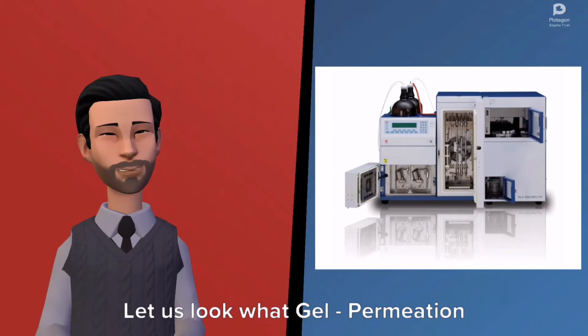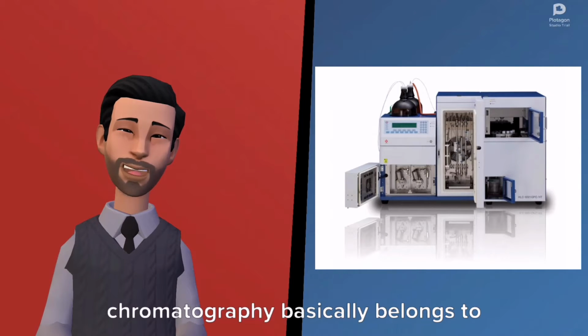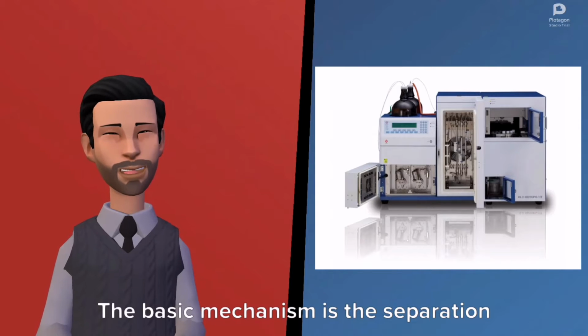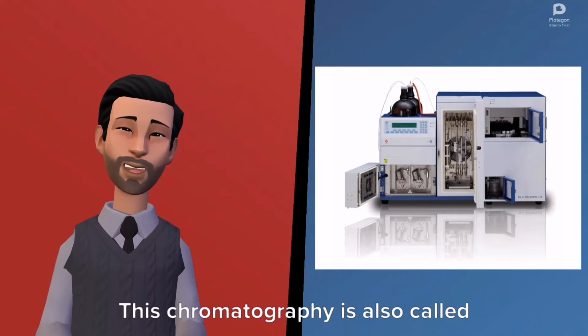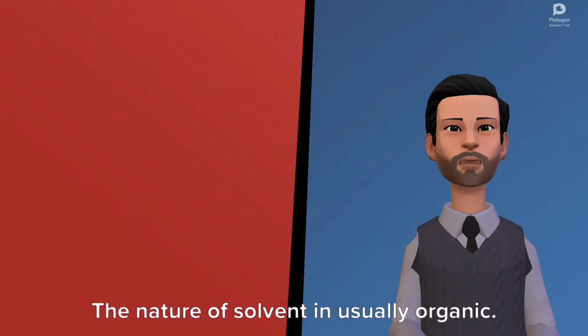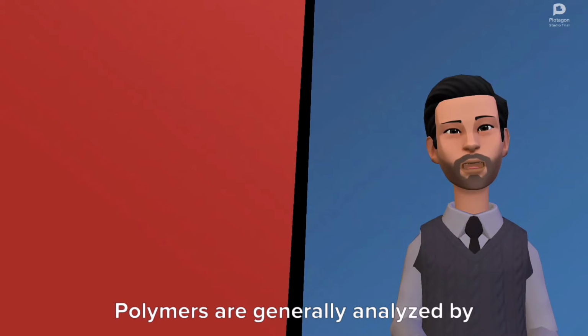Let us look at what gel permeation chromatography is. Gel permeation chromatography basically belongs to a category of size exclusion chromatography. The basic mechanism is the separation based on the size of the particles. This chromatography is also called gel filtration chromatography. The nature of the solvent is organic, and usually organic polymers are generally analyzed by this technique.